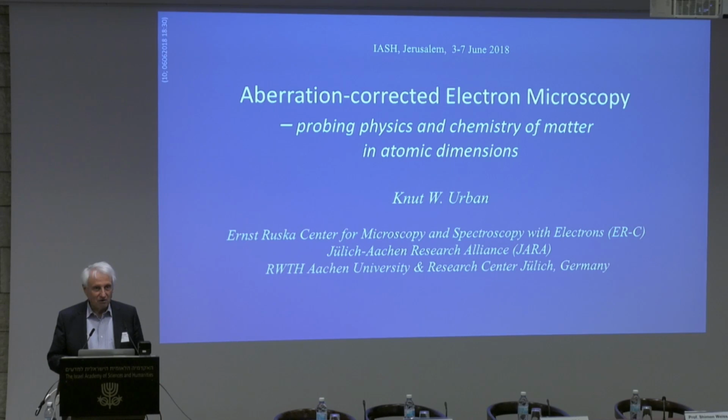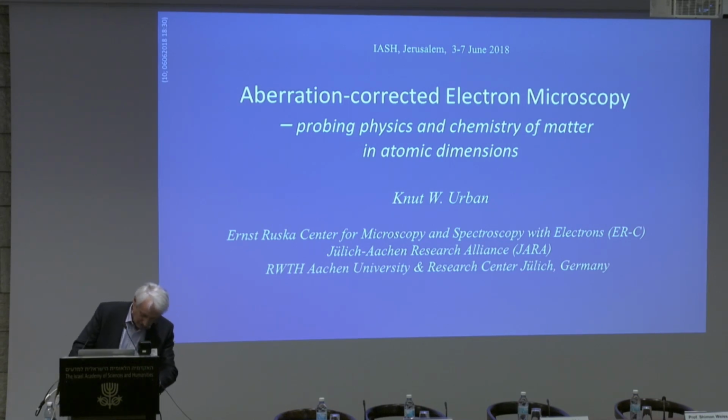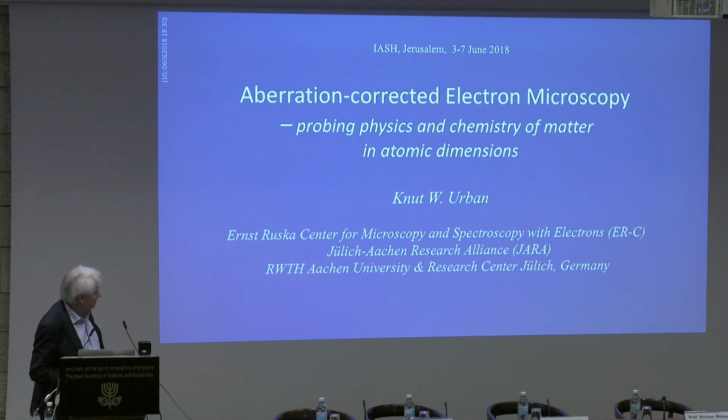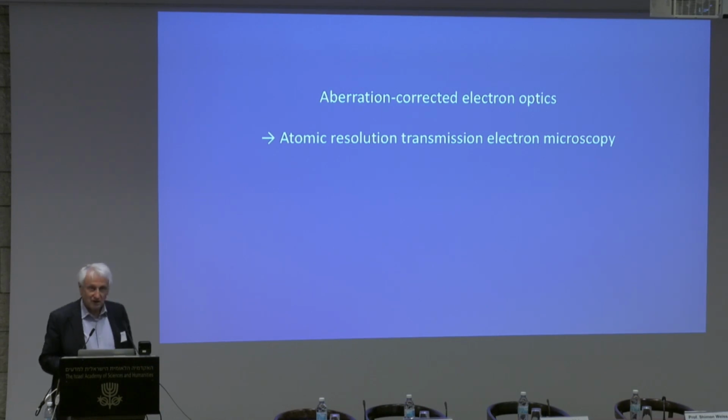And I have had the privilege to watch, or even more, to be a protagonist of the development of aberration-corrected electron optics, and this is what I'm going to talk about, because aberration-corrected electron optics have in turn allowed the development of atomic resolution transmission electron microscopy. So this will be mainly about dead matter, but nevertheless you can see some nice images, and I really admire the talks which I have heard here on living matter.